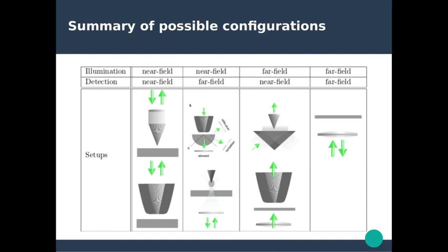and basically collecting the far field. And then of course you can have the near field configuration where you send light through an optical fiber, generate evanescent fields that will interact with your object, and then you collect the response in the near field through the same optical fiber.